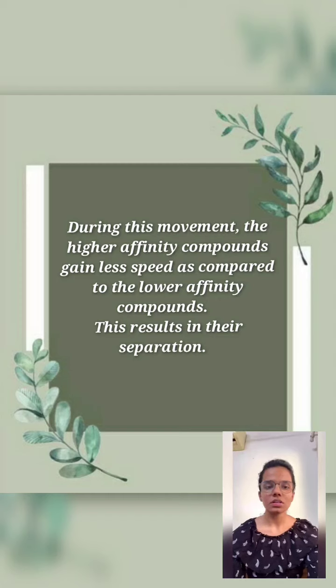Once the procedure is completed, different spots can be found on the stationary phase at distinct levels, reflecting various elements of the mixture. Basically, the compounds that are more attracted towards the stationary phase secure their position at lower levels, while others move towards the higher level of the surface. So, their spots can be seen accordingly.